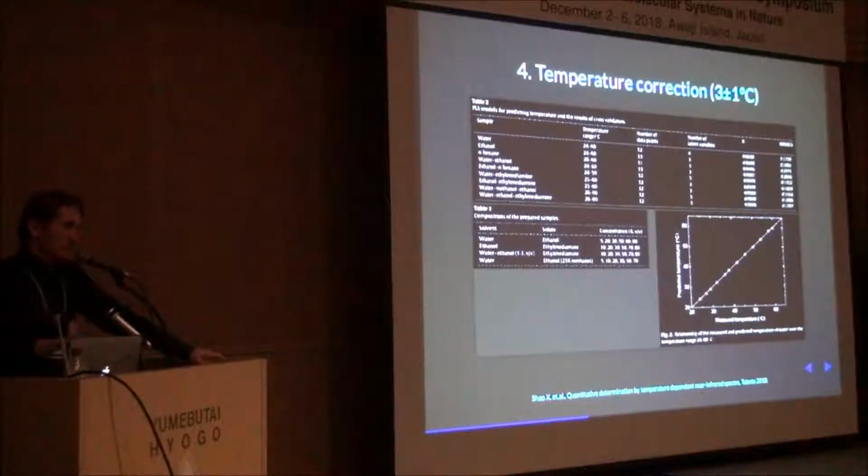The problem here is that there is not enough tension. When you work with ethanol, ethanol is pretty stable. Even at moderate concentration, a lot of the signal may come from or be related to CH, and CH doesn't pay too much attention to temperature. They're pretty stable. So any solution that you put ethanol in is going to be pretty temperature stable, and you're going to get a pretty good prediction. Working with pure water, however, will not give you that satisfaction, and that's what we were looking for.